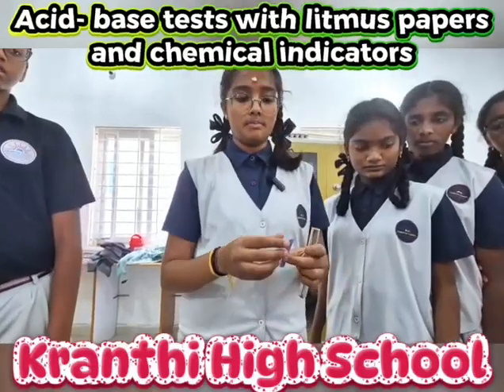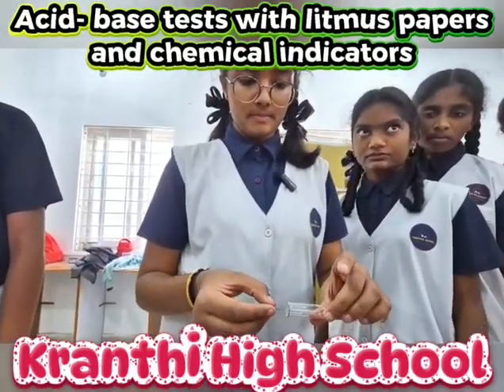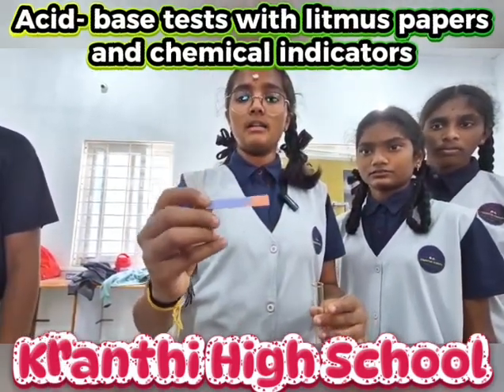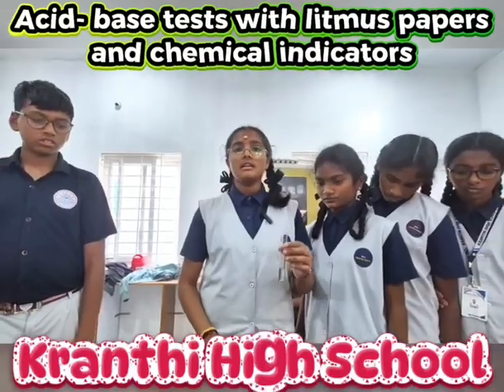Now let us see with the blue litmus paper. As you see, the blue litmus paper had turned into red. It shows that it is an acid.